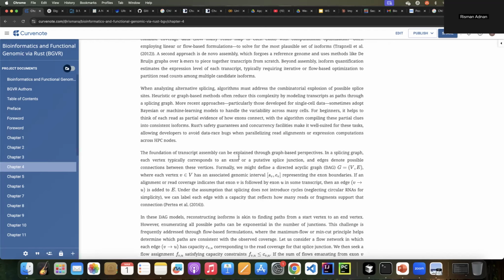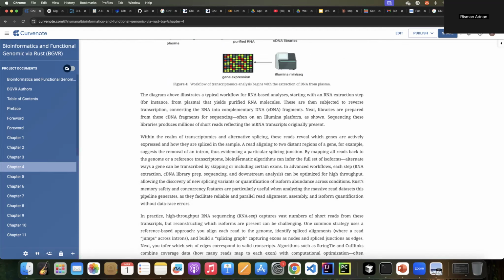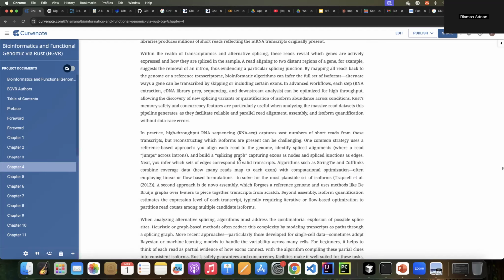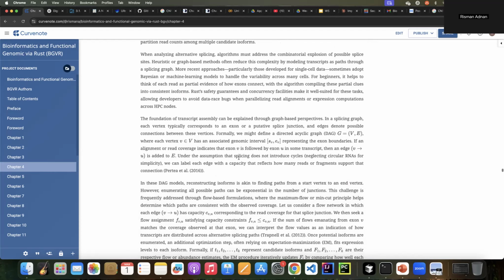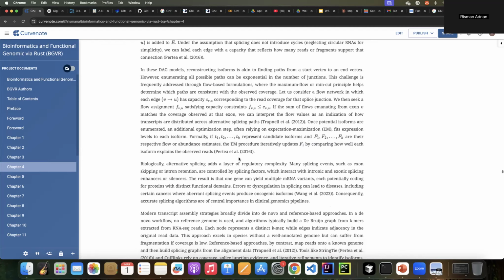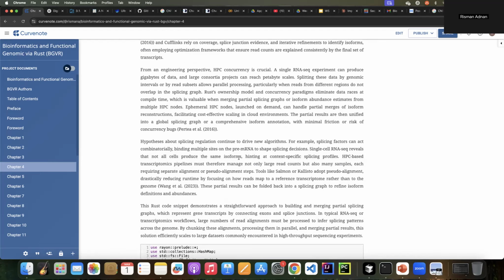Okay, so the RNA process is explained here based on this picture, and then you will also deal with many graph algorithms because this process contains some nodes and vertices, or processes and relations, that are best put in a graph instead of a sequential data structure. So most people use graphs for storing this kind of information and computing on this information. Once you know that they're using graphs, you can always ask for a use case scenario.